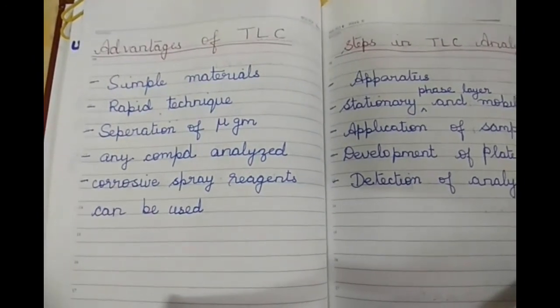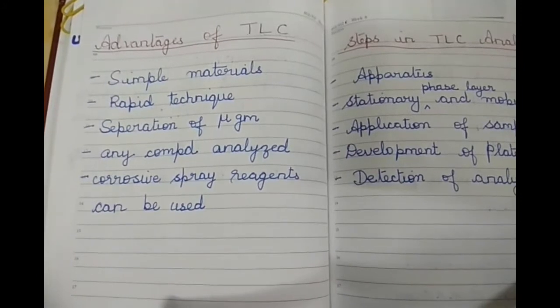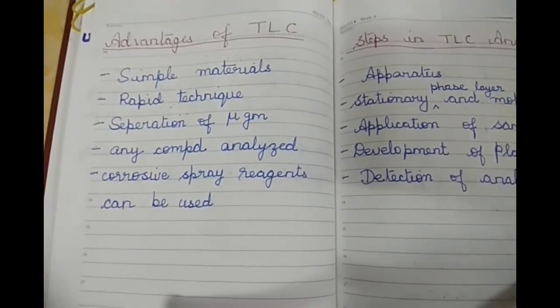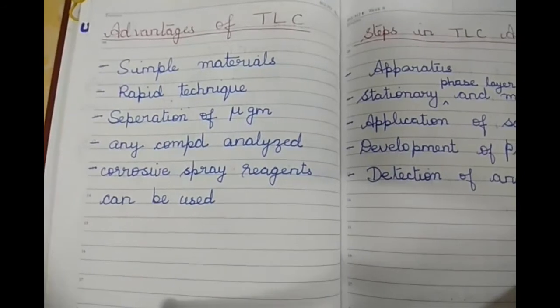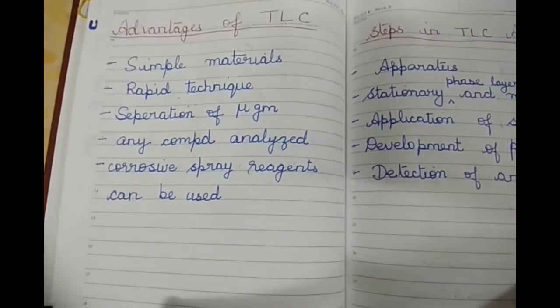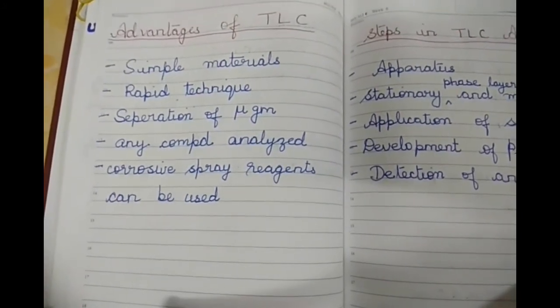It is a rapid technique and not time consuming like column chromatography. It also involves separation of micrograms of the substance, which can be easily achieved. Any type of compound can be analyzed. Corrosive spray reagents can be used without damaging the plate and need less solvent.